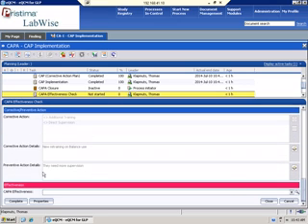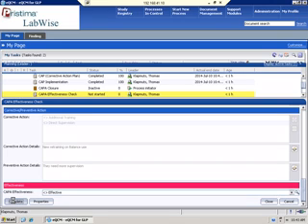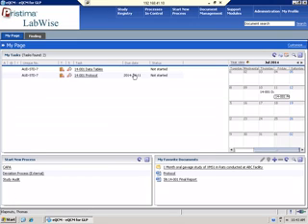There's the plan. And so, was the training effective? If it's effective, it'll close. If it's not effective, it'll go back through the CAPA process again. And you have to define why wasn't it effective, what additional things can be done. And so here, we'll say it was effective, and that'll close out our CAPA.